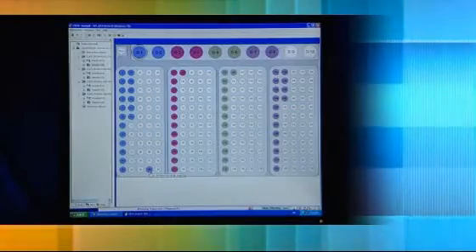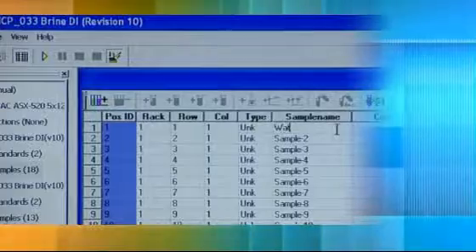The ICAP 6000 series software package, ITIVA, has a graphical autosampler display.